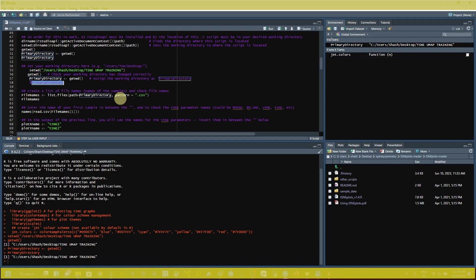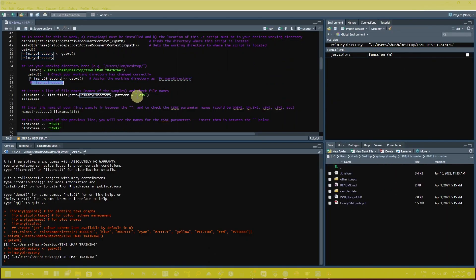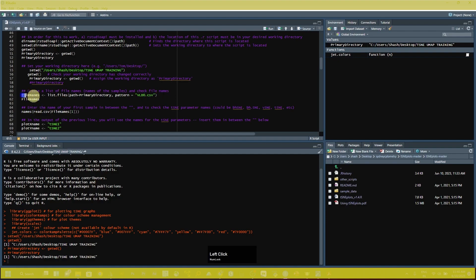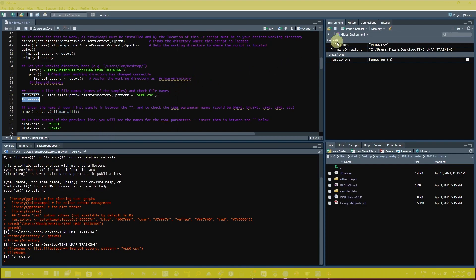After this, you can see the step to create a list of file names and check file names. The next step is to assign your data file that we exported from FlowJo. Copy the file name of the exported data file — in my case it is VLD0.csv — and assign the name in the script. Select the file assignment line and click Run. In the global environment you can now see the VLD0.csv file is present.